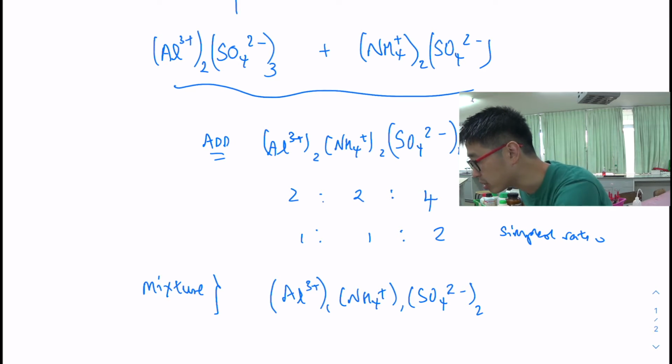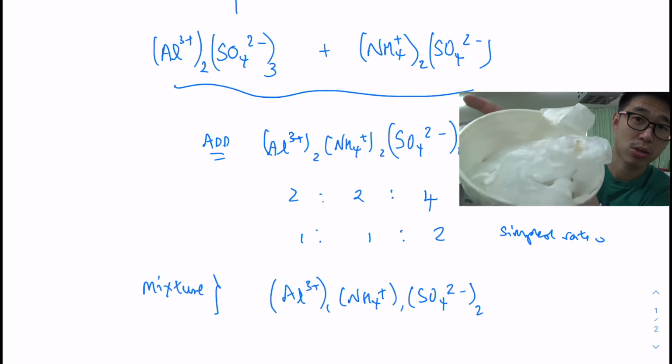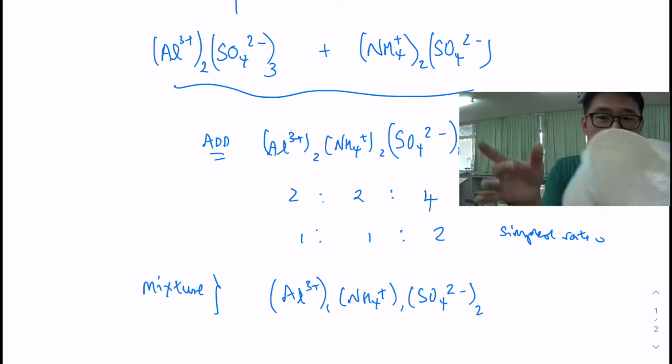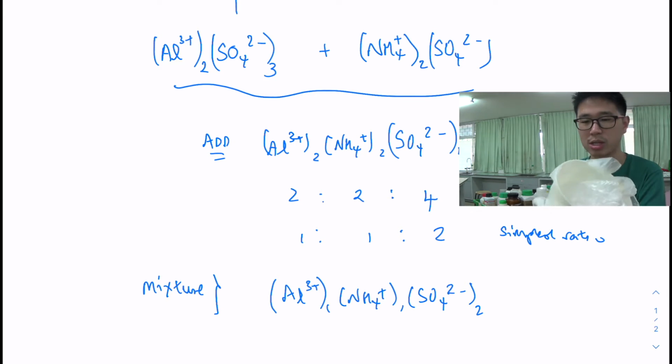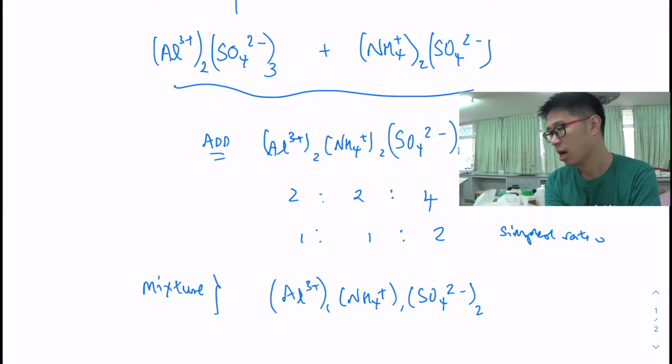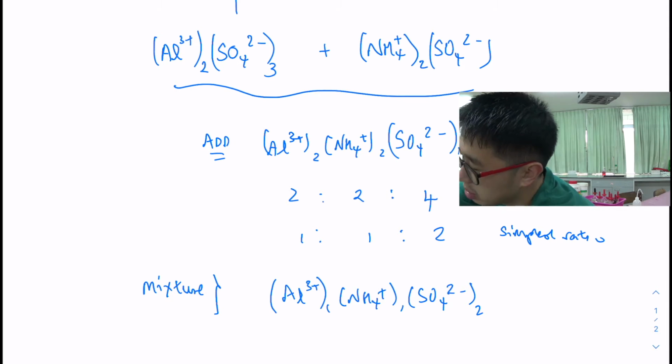It is a white powder, so it is solid, okay, but the top is pretty wet on the outside, so there's probably just the water of crystallization that has formed somehow. I mean, this was kept in the cabinet for a long time, and I'm based in a very hot and humid country, Brunei, so a lot of the chemicals are not at room temperature anymore.